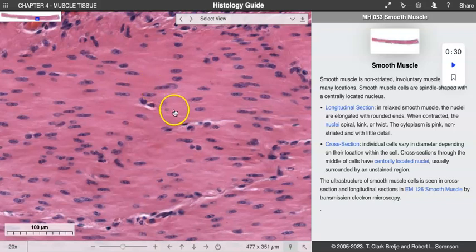We know that the cells are spindle shaped, and we teach that they're spindle shaped, but you might get here and go, I don't see that. The membranes aren't being stained for that, right? So what we would assume is that the center of the cell is where the nucleus is located. This is the thicker part of the cell, and then the cell tapers out to the side. Then you have one cell stacked on another, irregular or spindle-shaped cells, like tiles that stack together.